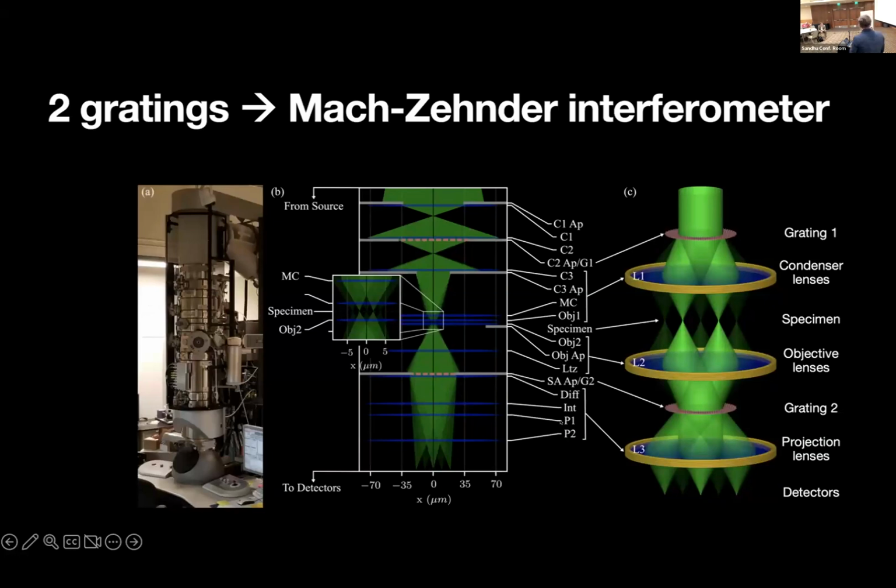Here's another more complicated system. There's actually a lot of different lenses in here. So there's projector lenses, there's 3 condenser lenses, and the grad students are impressed because they don't know how to hack those. It's like trying to do interferometry with a Canon. Is that a Canon or a Nikon? Where they purposely design these things to be a push button thing, and that's kind of how this is designed to be. So you have to hack it to be able to access these microscope parameters.